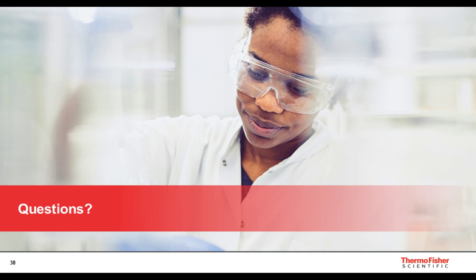Now, Dr. Kaboord, is the background seen on the silver stain gels of the IMAC purification normal? It is. If you have a protein that is really highly expressed, like a soluble protein, and you have a big band on your starting lysate lane, all that protein occupies the space on the affinity resin, okay? And there's not room for a lot of contaminant binding.